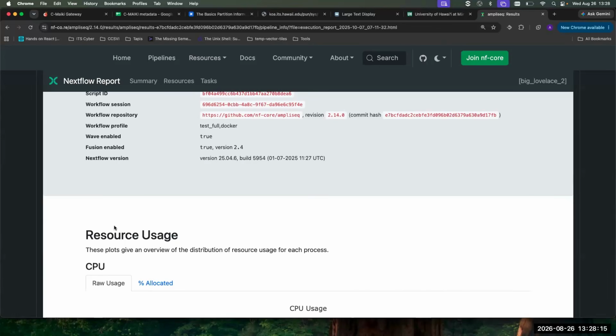Great. Do you know of any components in this pipeline that compare parameters, for example, where you cut your forward or reverse reads to be able to merge the most reads together? Are there any components that compare these, instead of the user having to run it at different parameters?